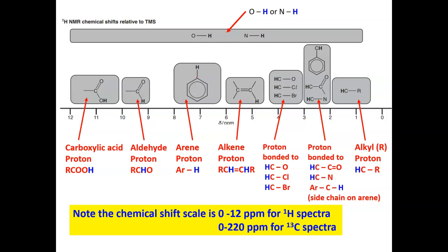What's very revealing and interesting is that if we have 5 arene H's on a molecule, that means something very important. We have a mono-substituted arene, where the 5 remaining protons are still attached to their carbons, but the 6th one has been substituted. Something like nitrobenzene or methylbenzene would have only 5 arene H's. 4 arene H's would mean a di-substituted arene. That's 2 groups replacing hydrogens on the benzene ring, and so on.